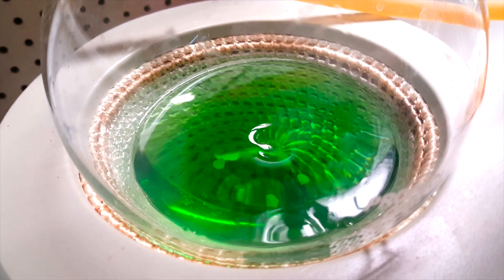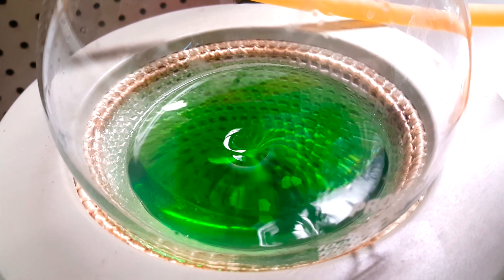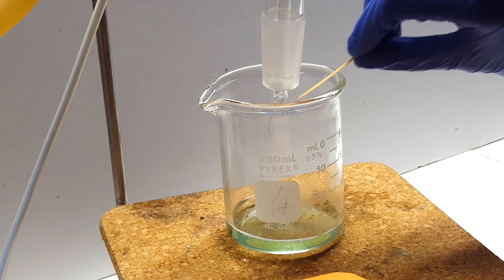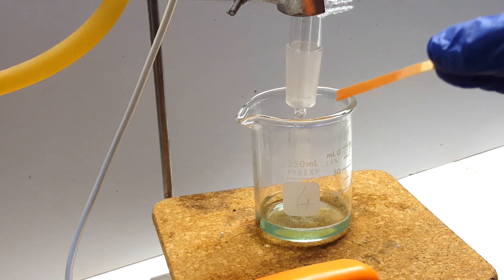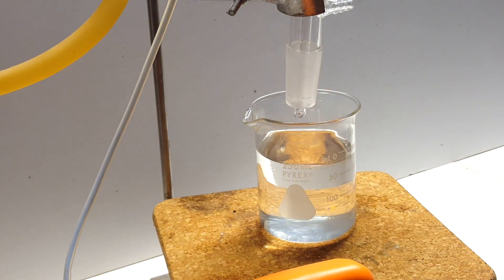I quickly let things settle down and stop boiling, and then added this incredibly impure distillate back into the distilling flask. Then, I carefully began heating and stirring again. I didn't switch my receiving beaker back to the original water-containing one until the pH of the distillate coming over was nearly neutral.